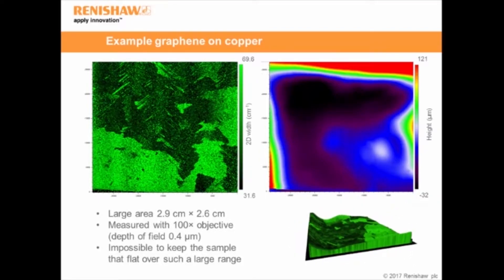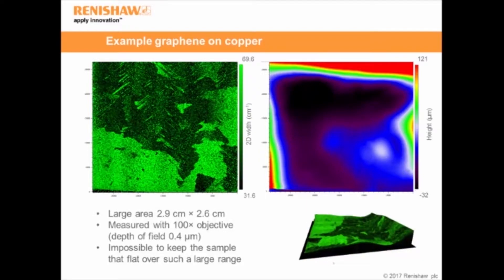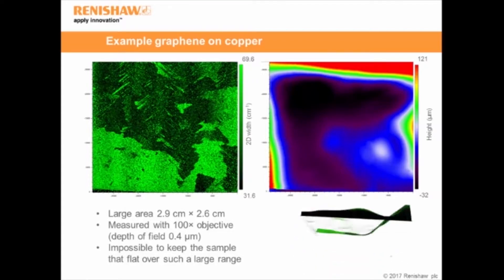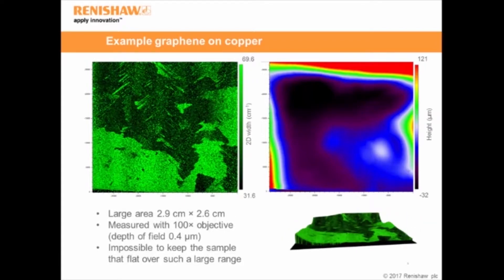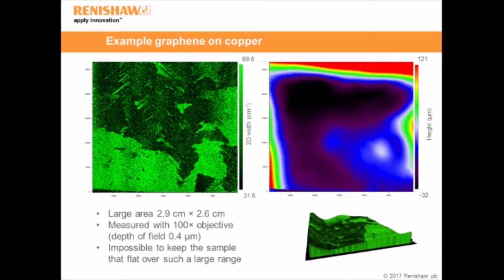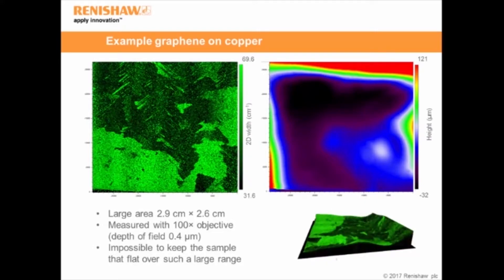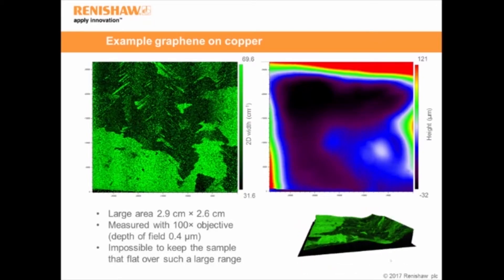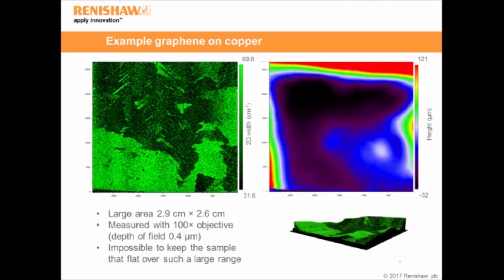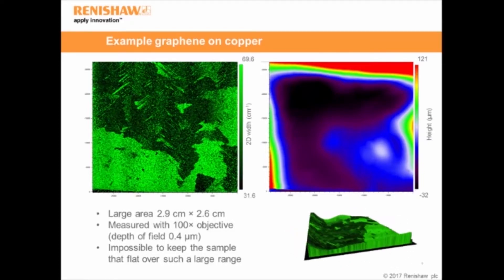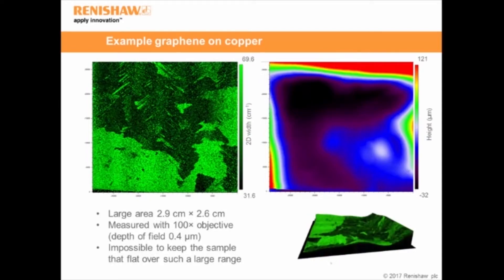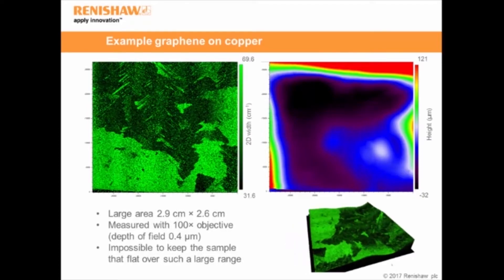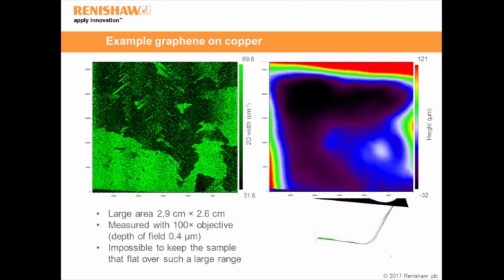The total change in height across the sample is around 115 microns. This is significant because we used a 100x objective lens, which has a depth of field of only 0.4 microns — so we're orders of magnitude different. Because we're able to use LiveTrack, we keep the sample in focus, whereas with a regular map we would lose focus very quickly. The movie at the bottom right shows the Raman map overlaid with the topography image, with the Z axis stretched to emphasise the actual curved nature of these graphene on copper sheets and to illustrate how difficult it would be to apply a manual correction for this curvature.